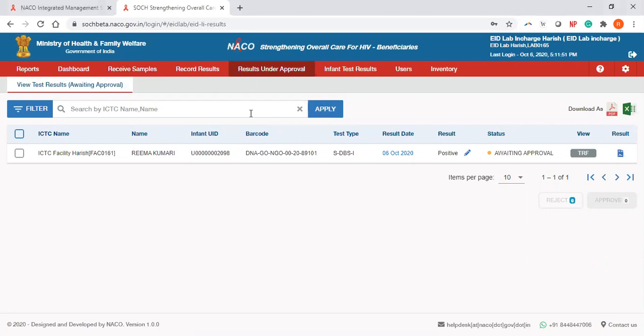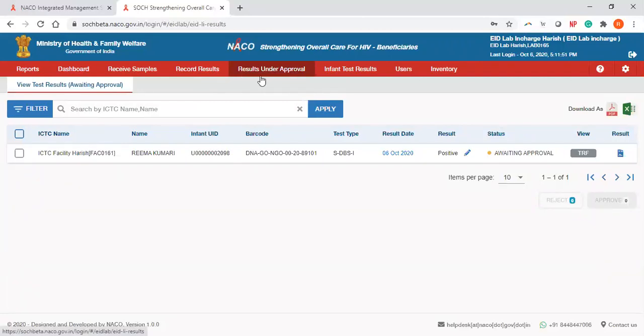After the lab technician enters the result, it populates under this tab called results under approval, which is available only with the EID Lab in Charge.